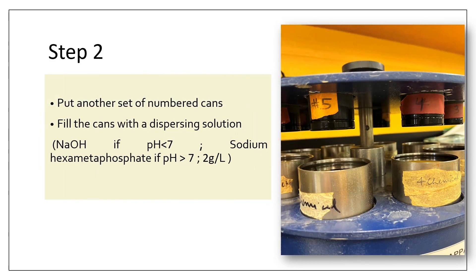Step 2: Now keep the sieves in the sieve holder as it is and put in every set of cans, that is the chemical ones, but at this time we have to fill the cans with dispersing solution instead of distilled water.